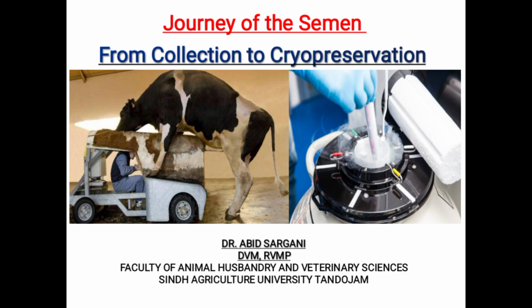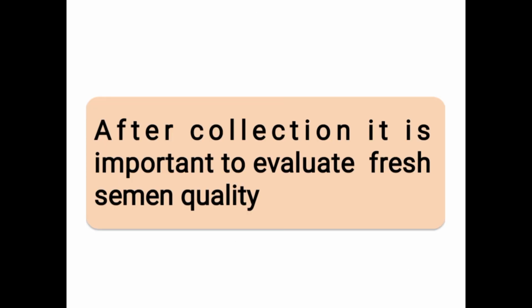Viewers, from our previous lectures, we were discussing the collection of the semen to the cryopreservation of the semen. In our previous lecture, we had a great discussion on collection of the semen, and in today's lecture, we will be discussing the next step, that is analysis of the semen quality.